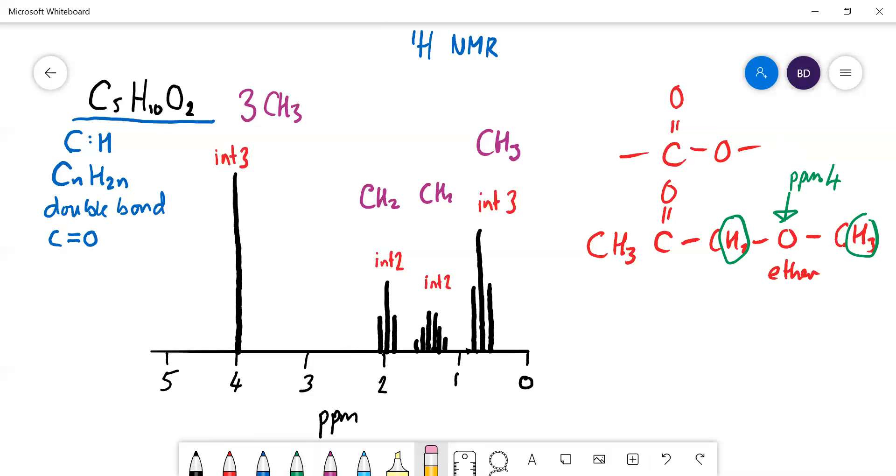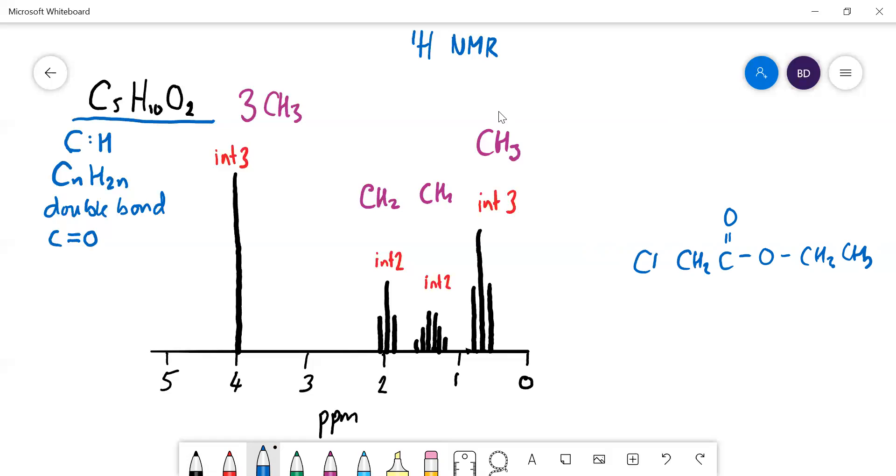A little bit of trial and error. We've only got five carbons to think of. Let's put an ester. We could have something like that. We could then chop this off and stick that down there, or rearrange the carbons around here. Let's have a think, let's have a look at this singlet.